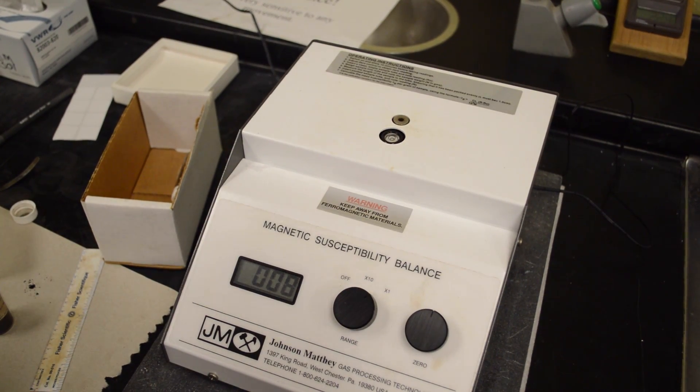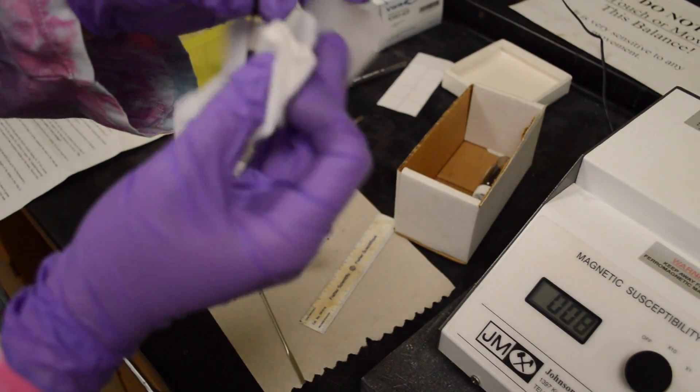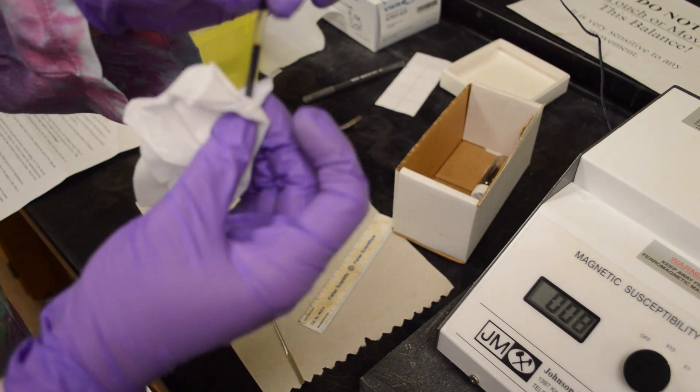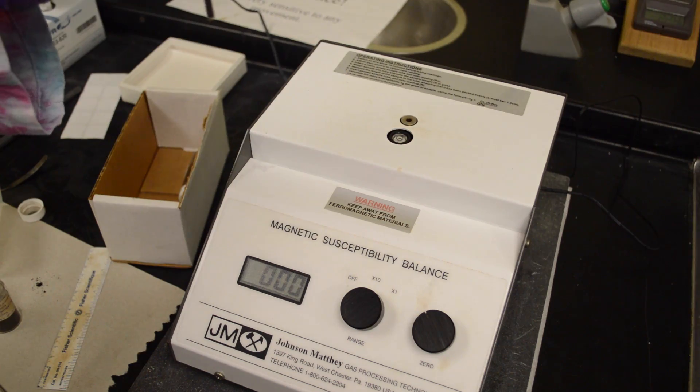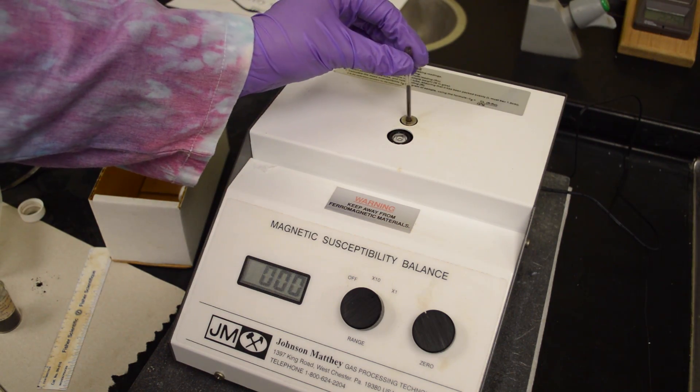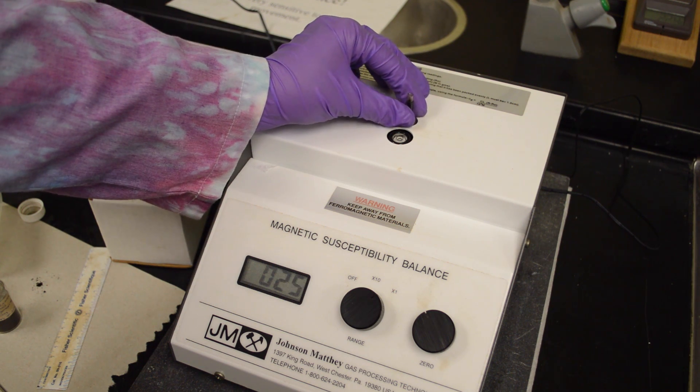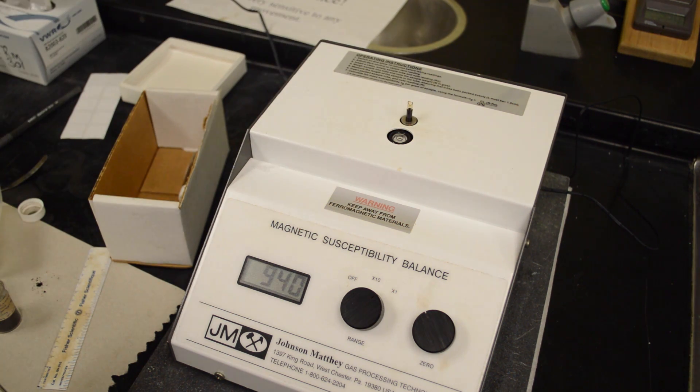Before you put the vial into the balance, wipe it off with a Kimwipe to ensure that there is no product on the outside of the tube. Then place the packed tube into the balance and take the initial reading.